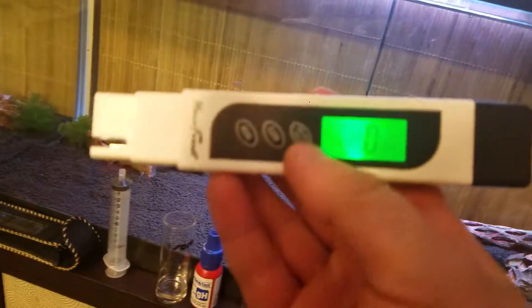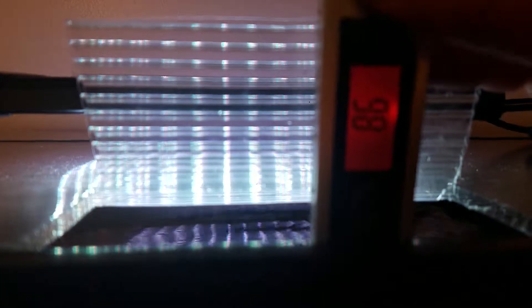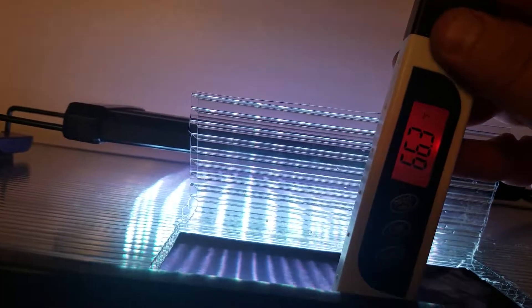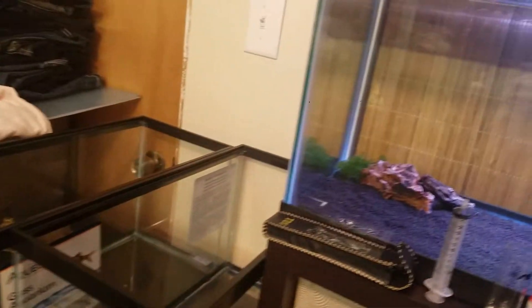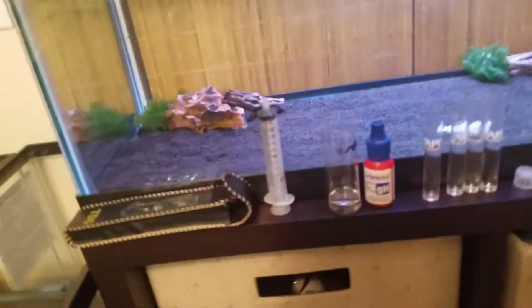First up, let's turn on the TDS meter — it turns to zero. You put it in the water, make sure you get it down to about the line, and let it count up. We're at about 86 TDS. Turning it to Fahrenheit, we're at 66.3 degrees, which is actually pretty good because Caridina want the water a little bit lower temperature.